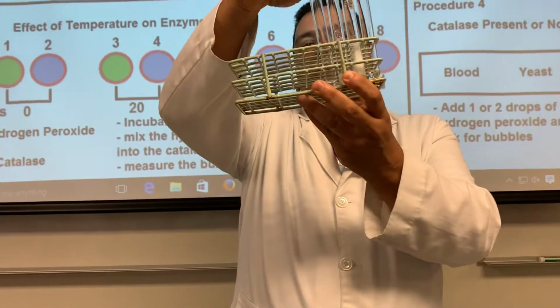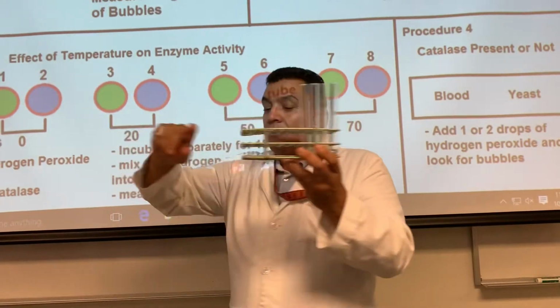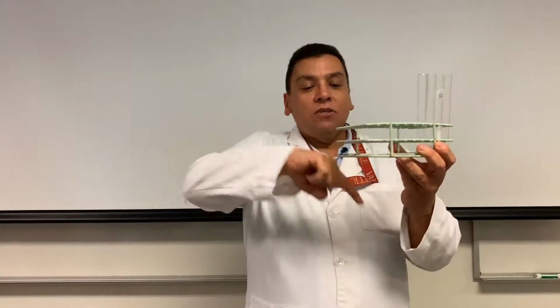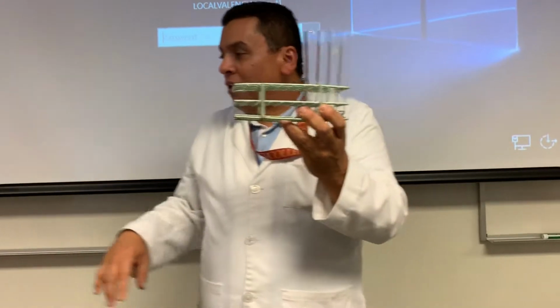It should not have done this with this one. It should have been the highest here, so it should have produced a bell-shaped curve. But you graph what you get. All right, so it is kind of bell-shaped. It's kind of flat on the top of the bell there.